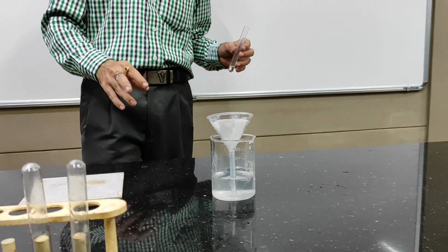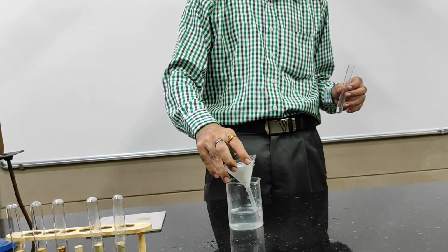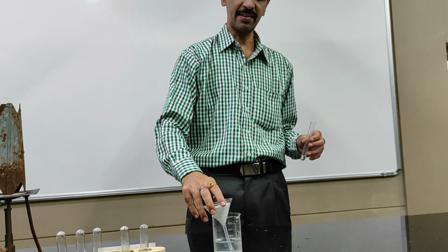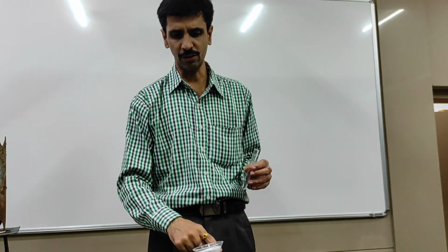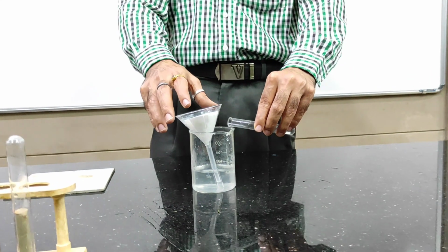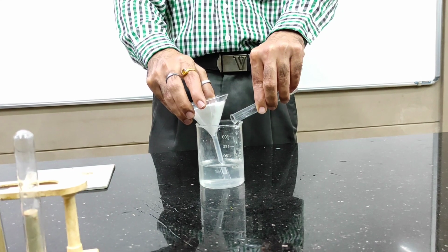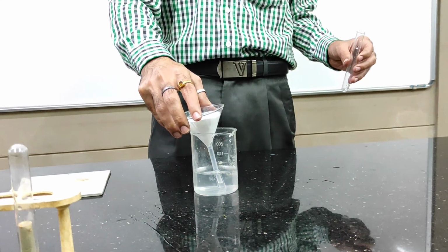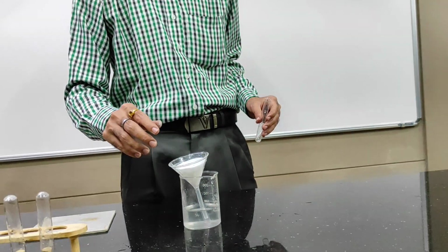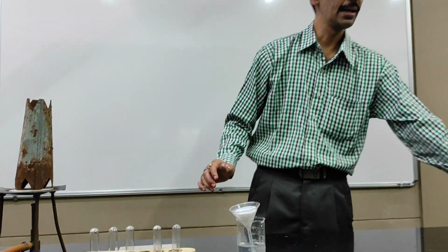Now see, we have done the entire filtration process, and also the washing part. Now the filtrate that we have is supposed to be NaCl. We'll just check for the presence of sulfate ions in the filtrate. We have barium chloride over here, so I just add a few drops of barium chloride and see this. You don't get a precipitate. So it is very clear that all the sulfate ions are on the precipitate, on the filter paper. Alright, now we proceed to the next step.